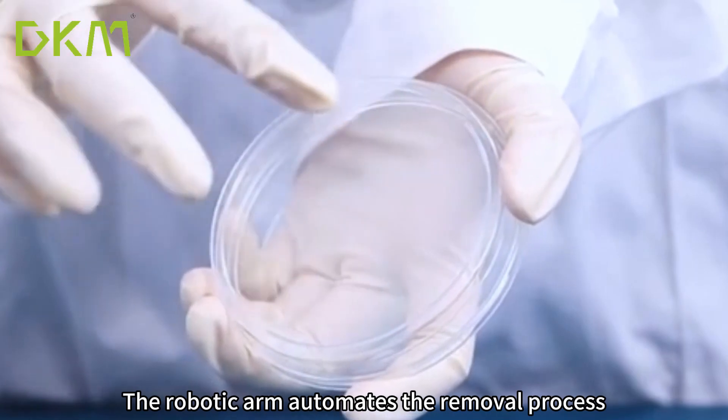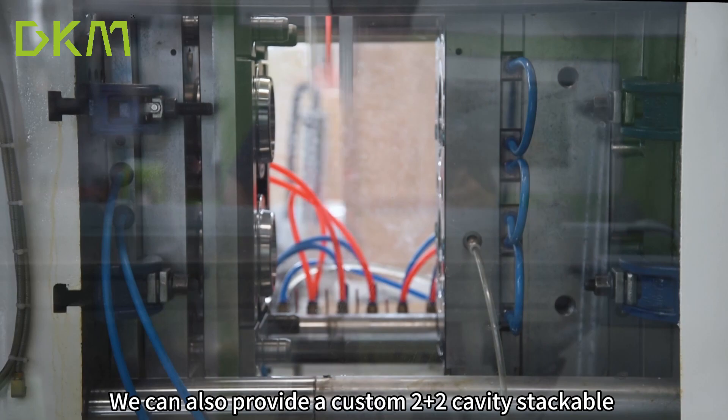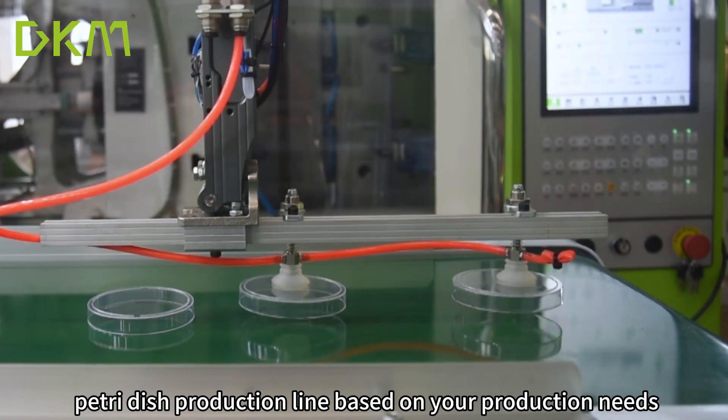The robotic arm automates the removal process, ensuring convenience and efficiency. We can also provide a custom 2-plus-2-cavity stackable Petri dish production line based on your production needs.